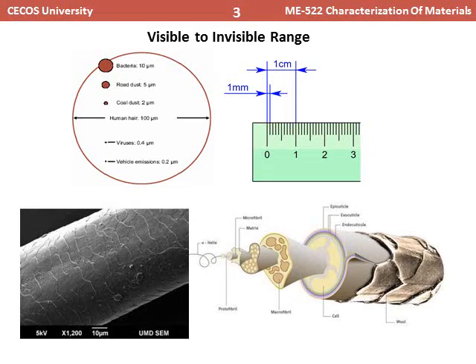So as I mentioned, the hair is a big circle. If we look at this normal human being hair by scanning electron microscopy, the things that are visible to us by naked eye are totally different when we visualize the object under scanning electron microscopy.